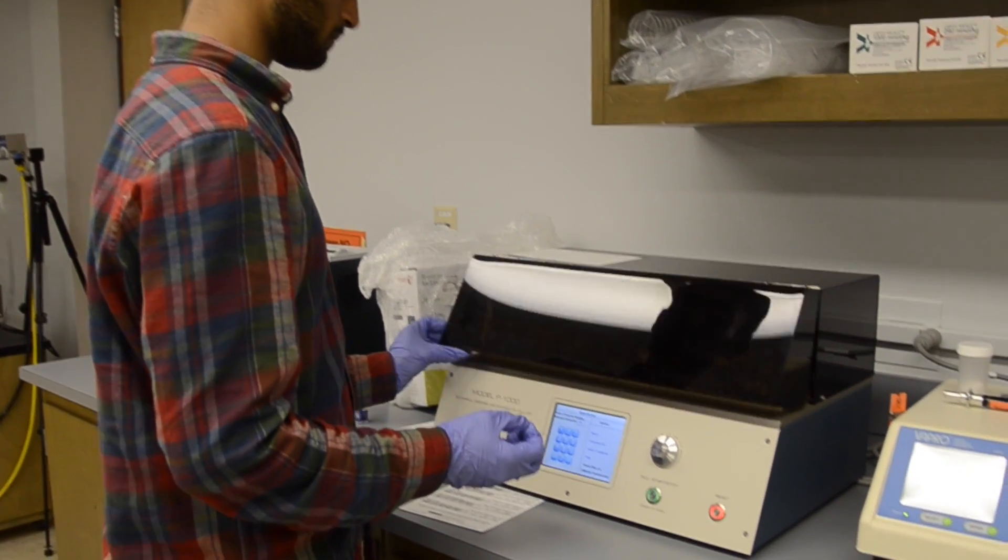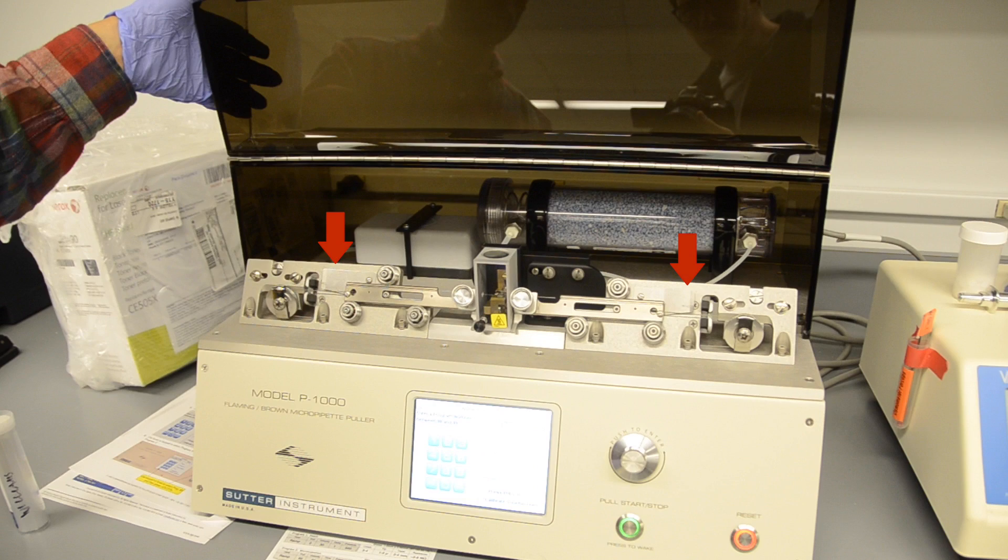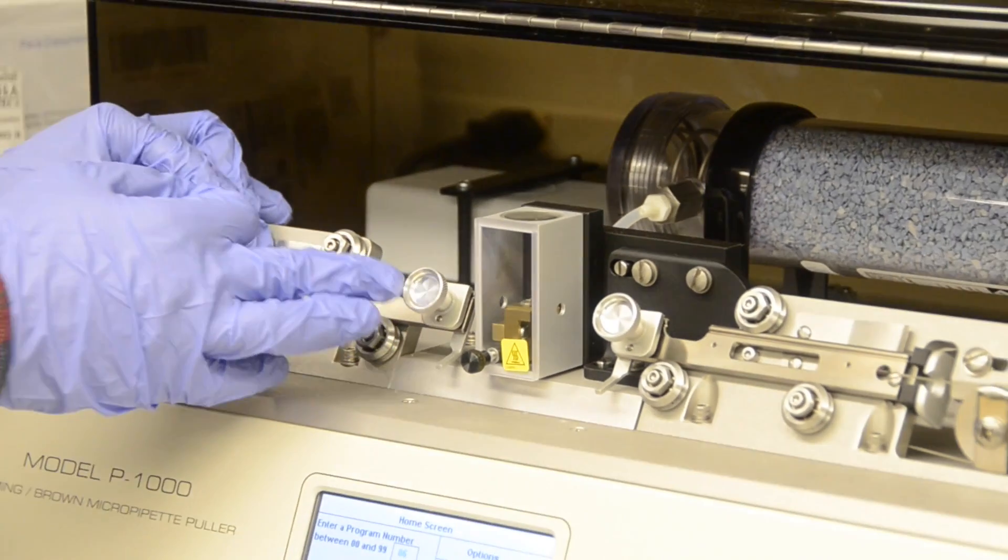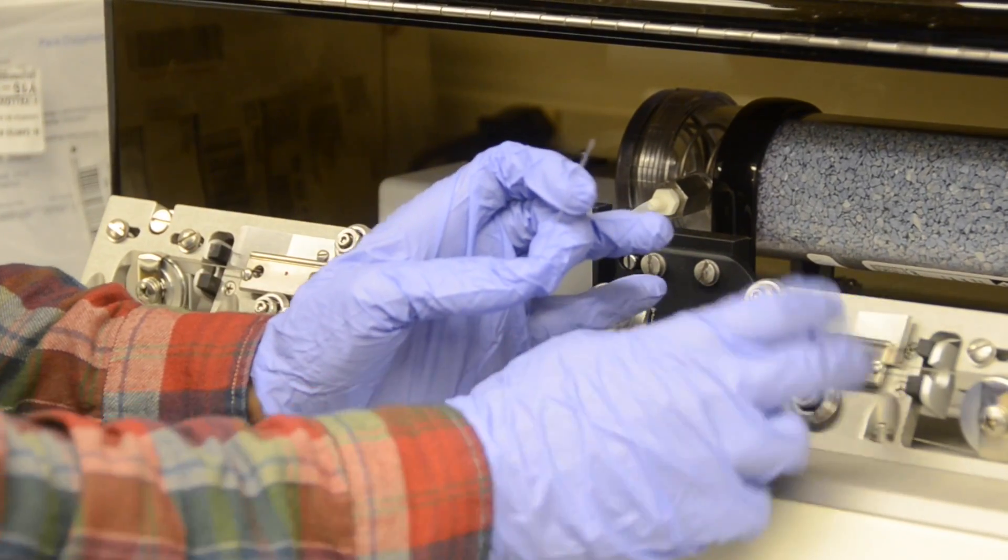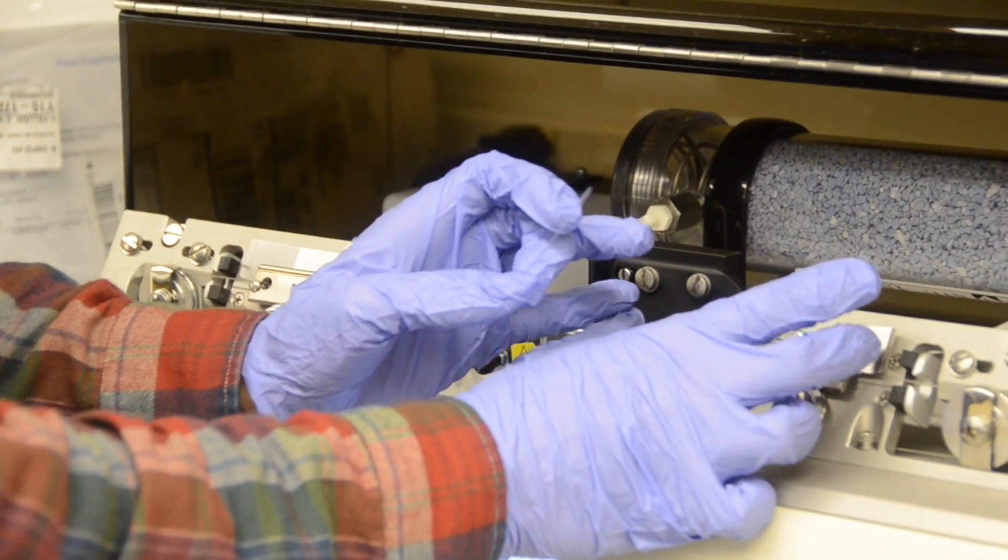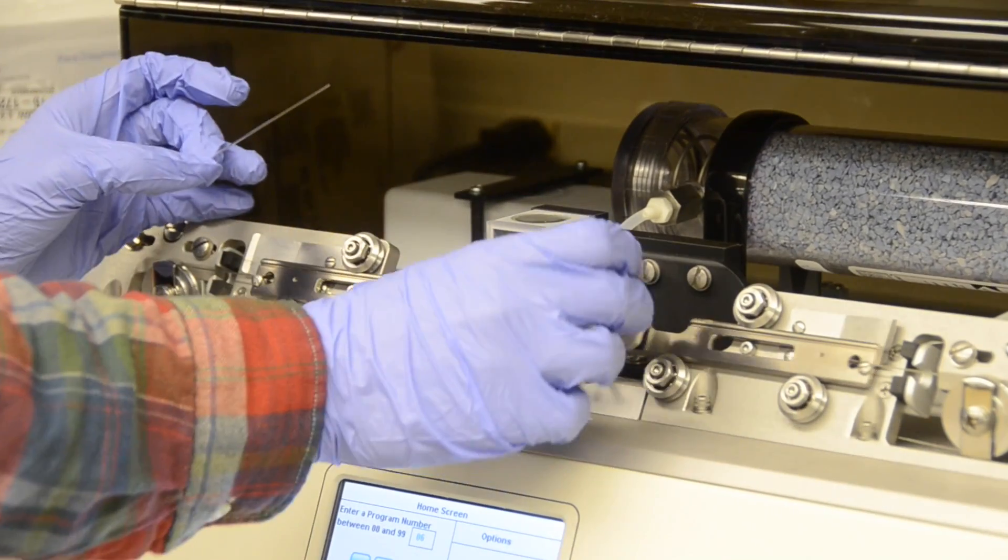Open the lid of the needle puller. Release the sliding capillary tube holders by pressing the latches. Make sure that the screws on the holders are loose.